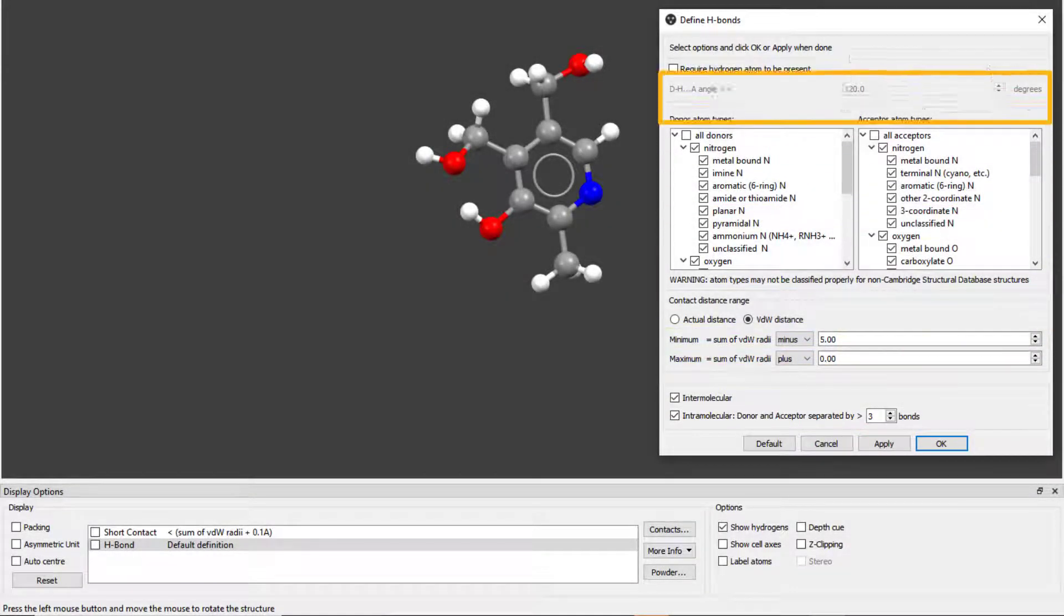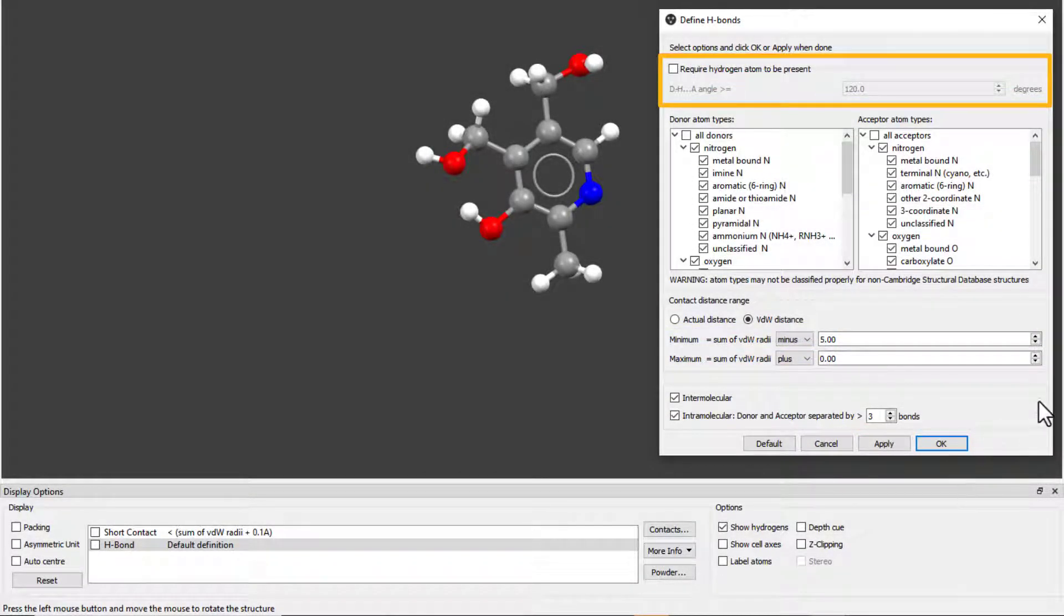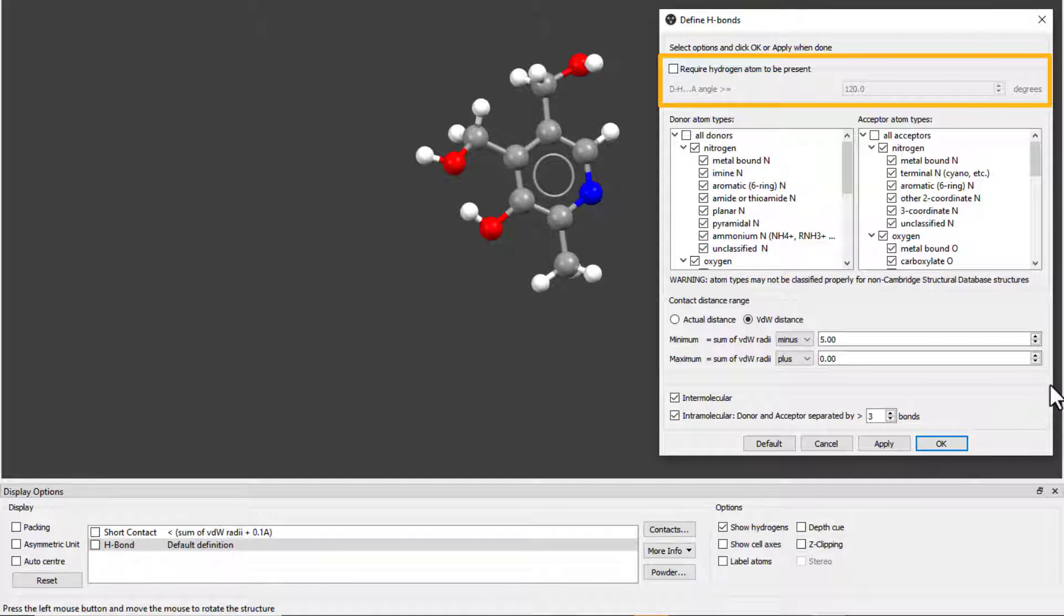At the top of this window, we have the option to require hydrogen atoms to be present. When this box is unticked, it is not necessary for the 3D coordinates of the H atom to be known.